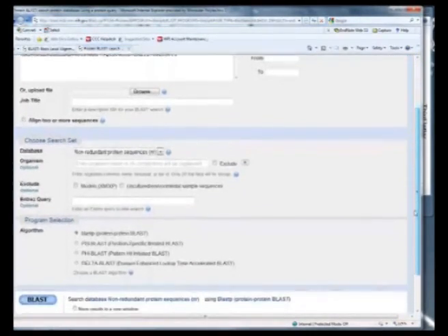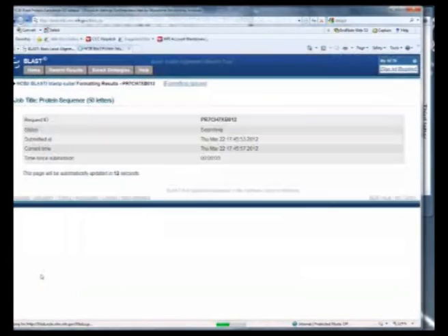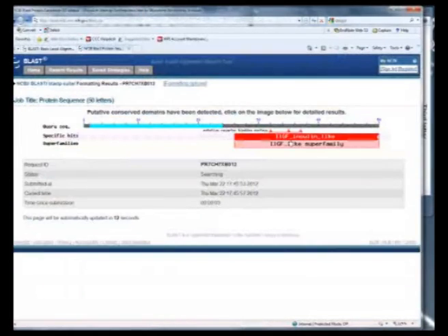You can also choose a different algorithm based on your sequencing need. When we click BLAST, we can see that our sequence translates to the human protein insulin, in addition to learning which family of proteins it belongs to. Click on the protein for more information, a description of its domain, and the references used to display the information.